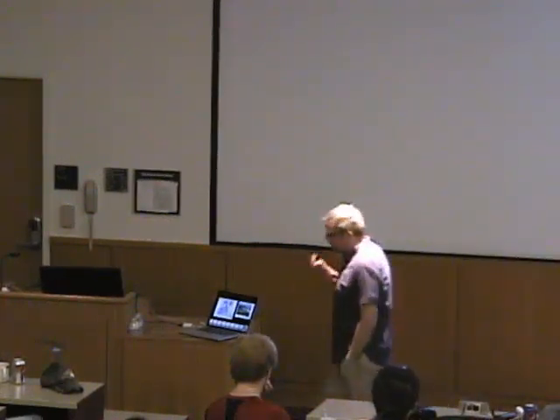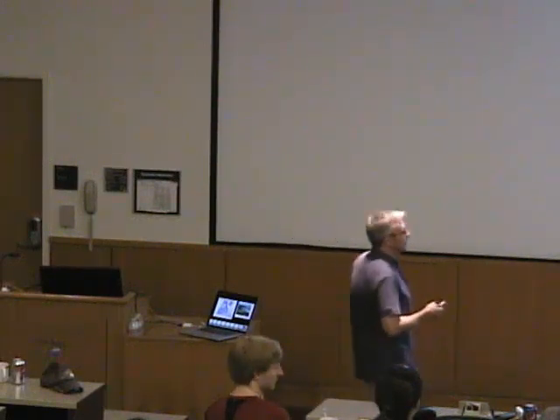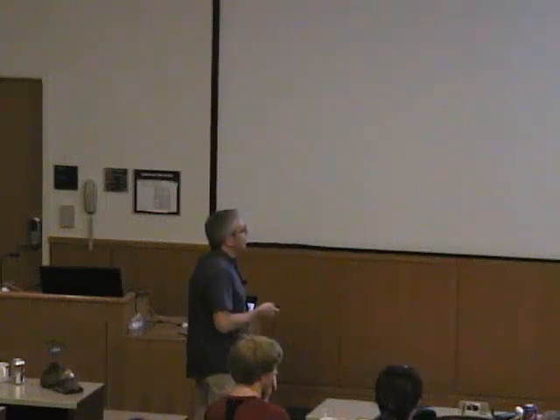And just to keep in mind, this is an electron density map, and this is really the end of it. This is the result of the experiment. That's what we want to get, and this is what we have to interpret. But keep in mind that a ball like this that you see in here is a single water molecule. We don't see the proton, so in fact it's an oxygen atom. And we see this directly at angstrom or sub-angstrom resolution. So we have the atomic microscopy that we're actually trying to get. And from here on, it's just interpretation. And if we get to that point with one of the electron densities, we kind of feel like we're in paradise.